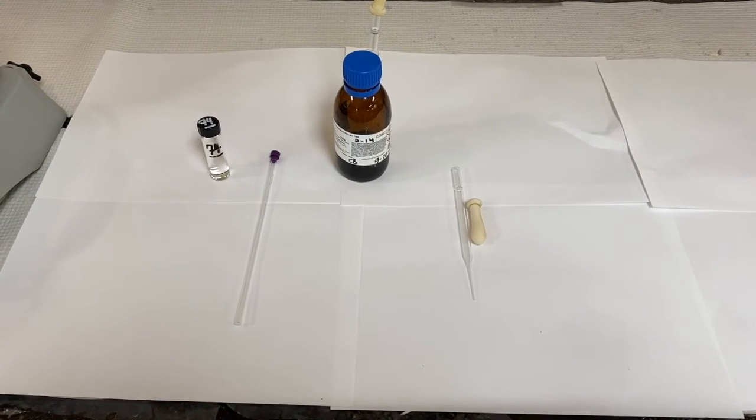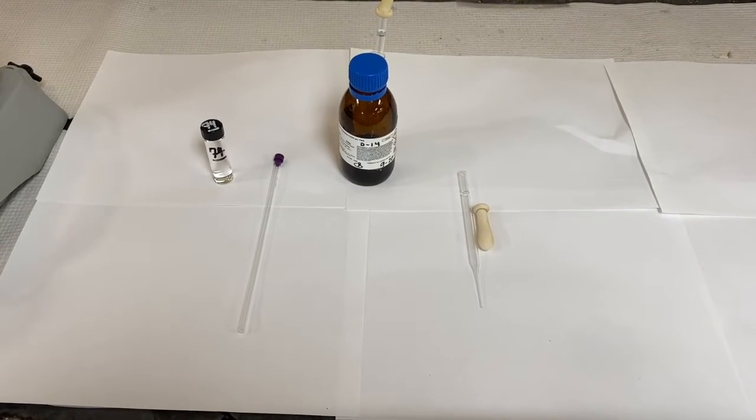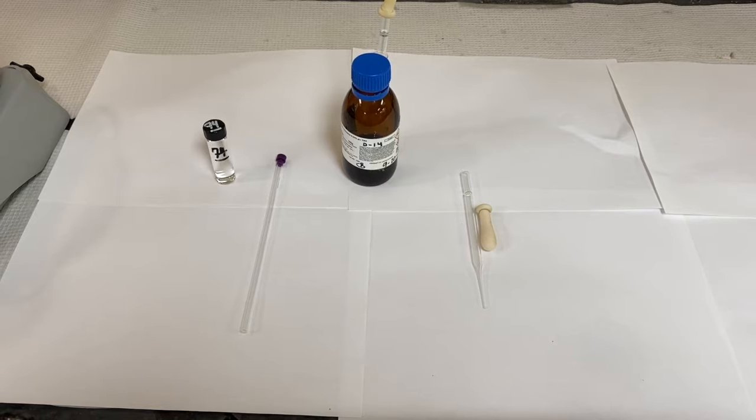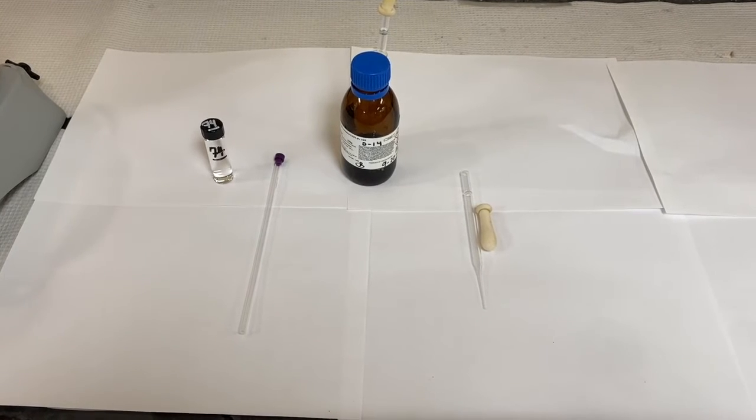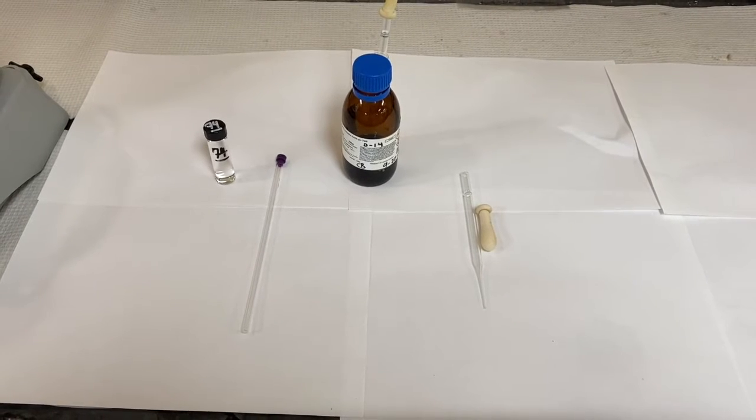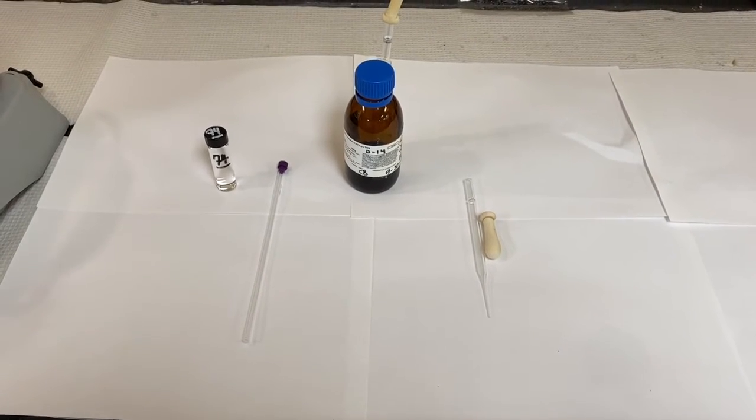We're going to show you in this video how to take an NMR spectrum of your liquid unknown. You'll need a few things to accomplish this.